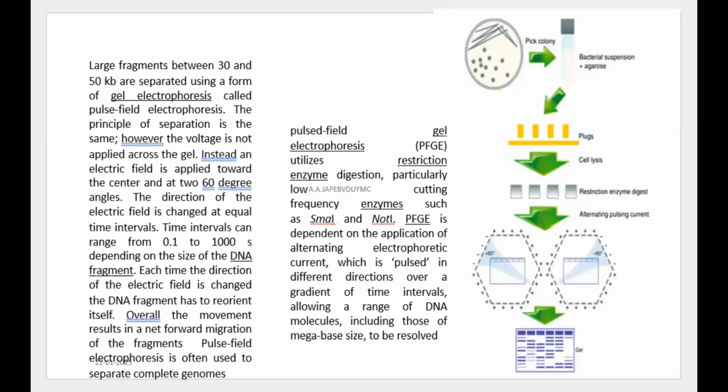So they will start the second pulse at a different angle, and the molecules will move in the new direction, and alternately you are applying the first field, then the other field. So you are switching the field, and their angles are different. So continuously the molecules are under reorientation, and they start moving in a different direction every time. So initially there is length dependent relaxation behavior.